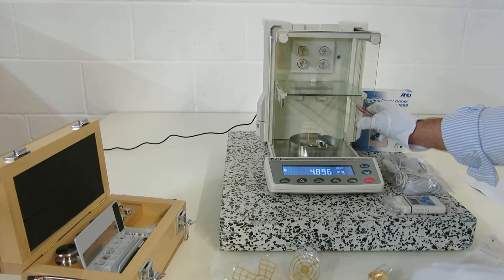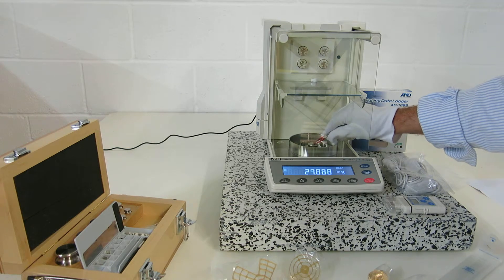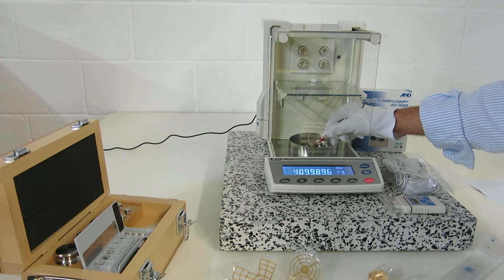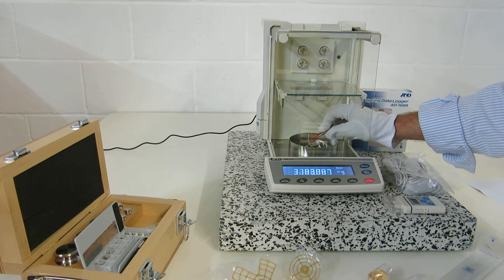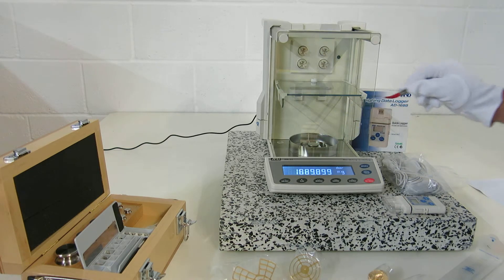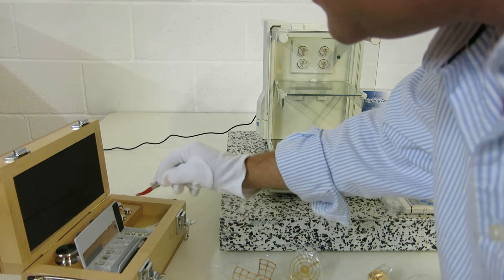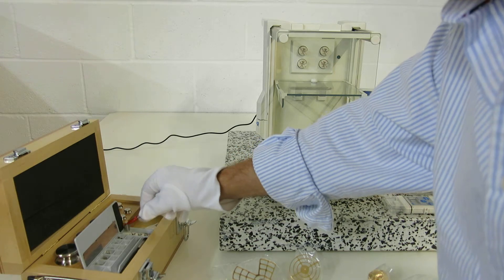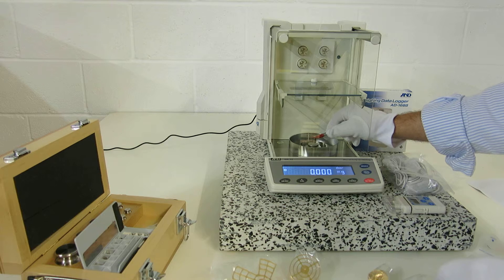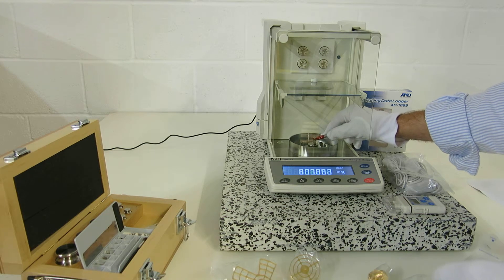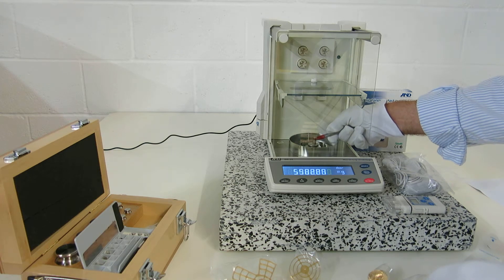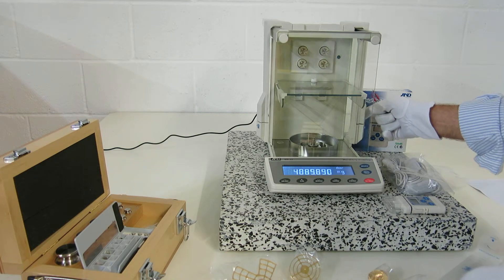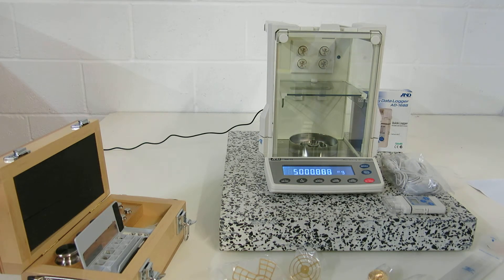So I'm going to take this off here. Perfectly. I'll just put a slightly larger weight on.